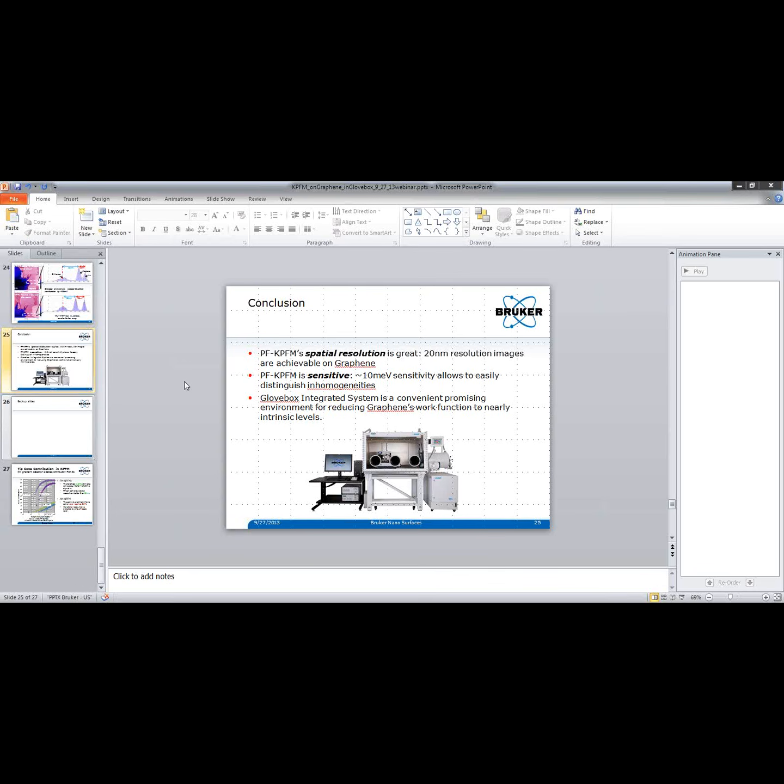And Aravind, maybe you can answer this question about what exactly the dopants do. Well, if you're talking about oxygen, it's a P dopant. When you have oxygen absorbed, the absorption process results in charge transfer, or interaction between the orbitals of graphene and oxygen, and then you have P doping.